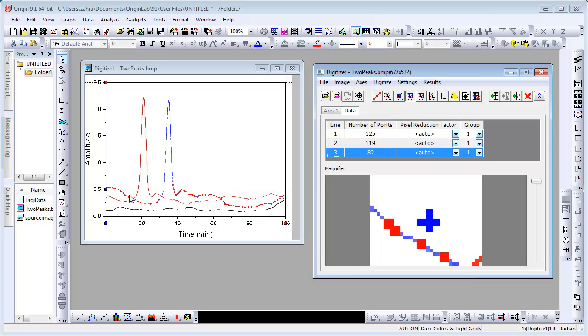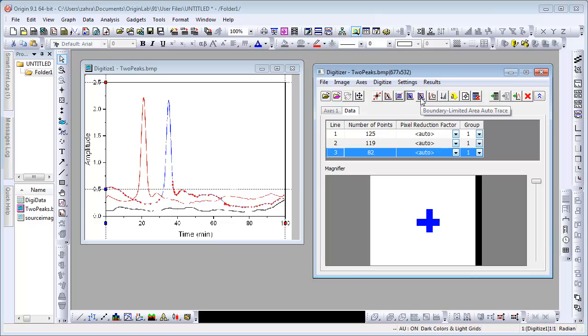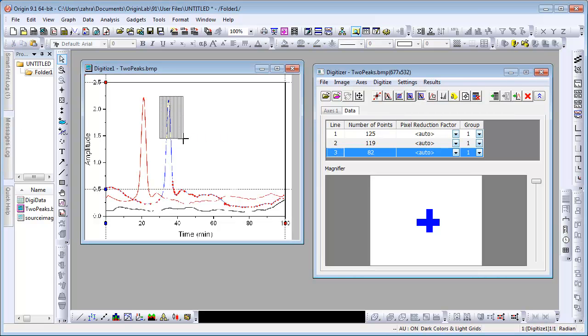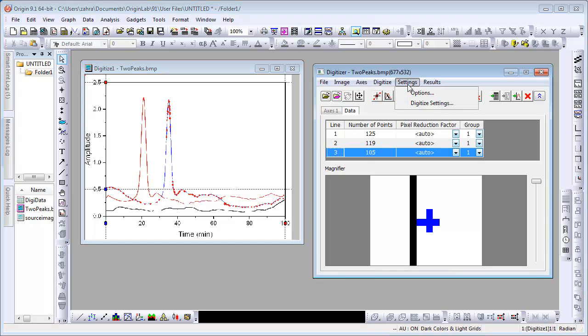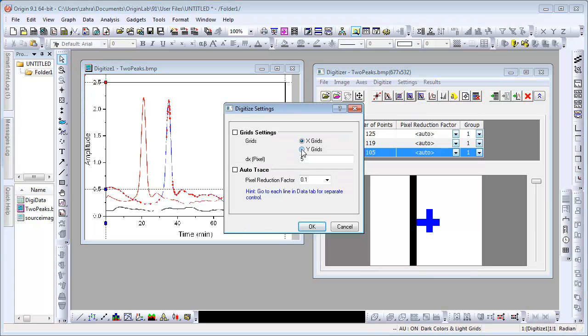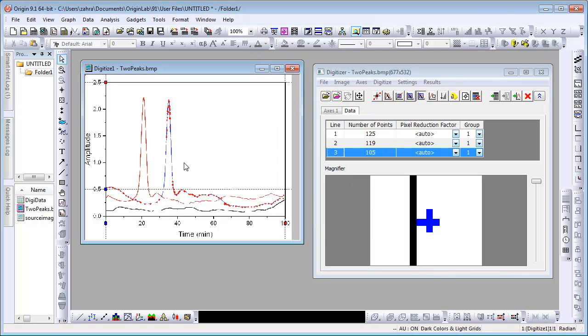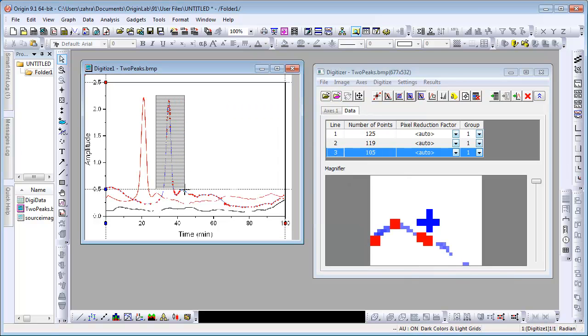This method is a hybrid of the previous two methods so points will be captured within the rectangle and along the rest of the curve. The last method, the Boundary Limited Area Auto-Trace method, is different since points are collected only within the rectangle. This method is also different from Area Auto-Pick Points by Grid since points are not collected just where the grids intersect with the image but also in between. Here we can see that the grid orientation is not optimal so under Settings, Digitize Settings, we change it to Y. Click OK and finish digitizing the rest of the blue curve.